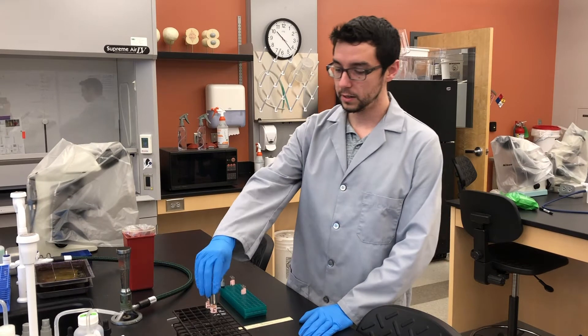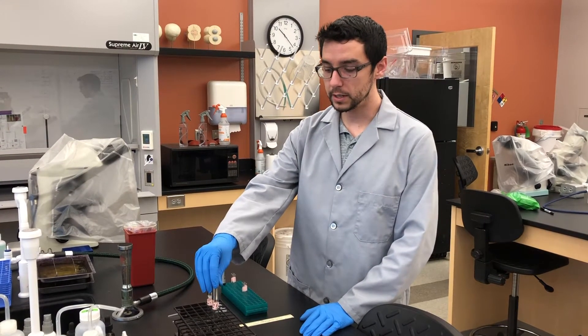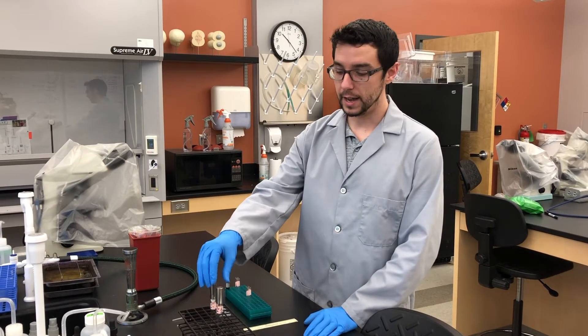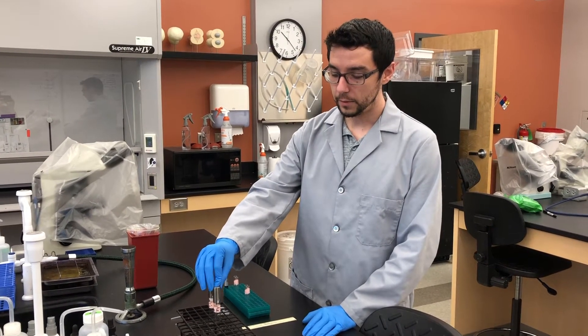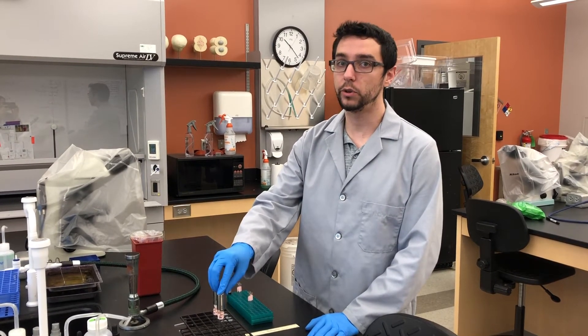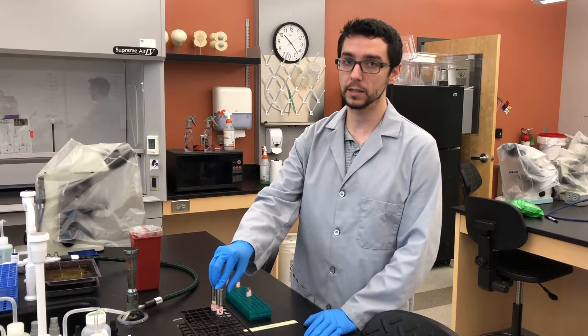For this activity we are going to be working with Enterobacter aerogenes and Escherichia coli. We abbreviate these EA and EC, so it is going to be extremely critical to pay attention to the labels throughout this activity. Do not mix them up.